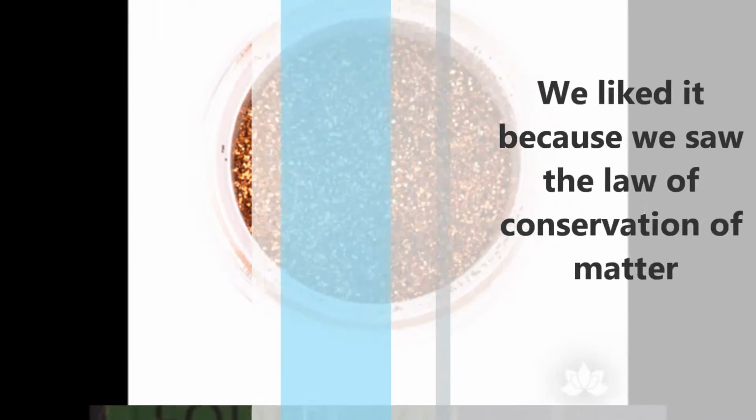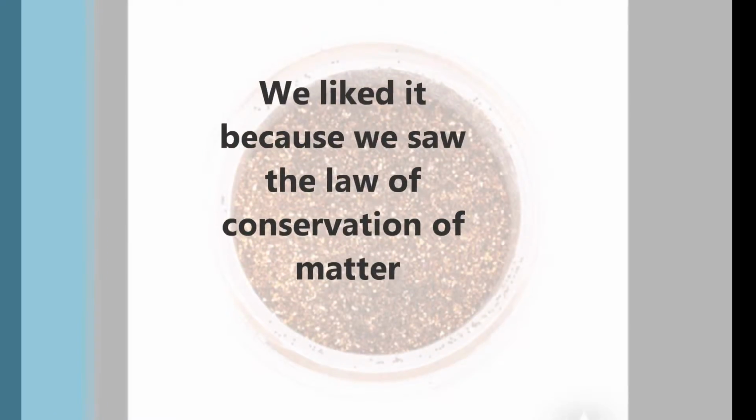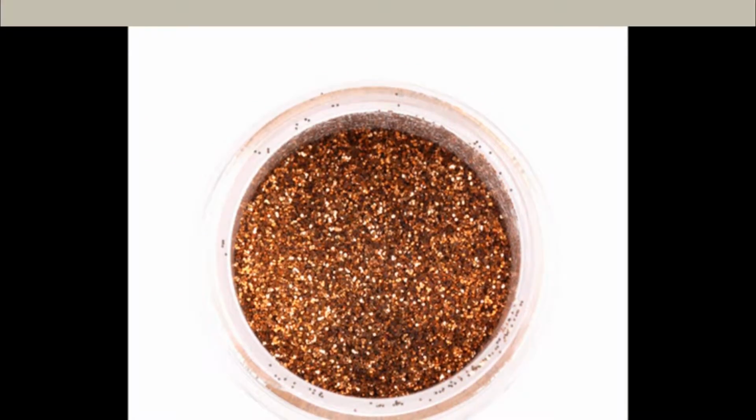We like it because copper, after being transformed, can return to its metallic state, and with this the law of conservation of matter can be observed.